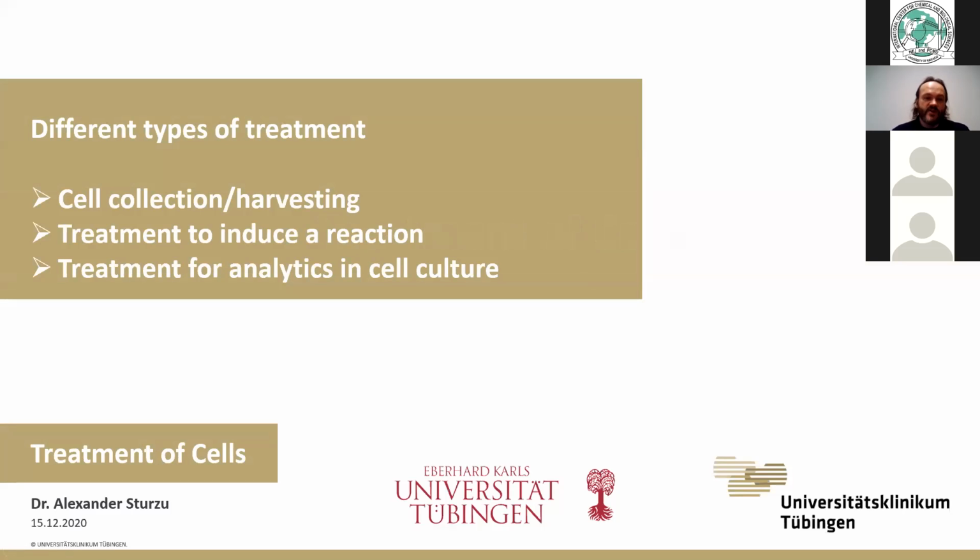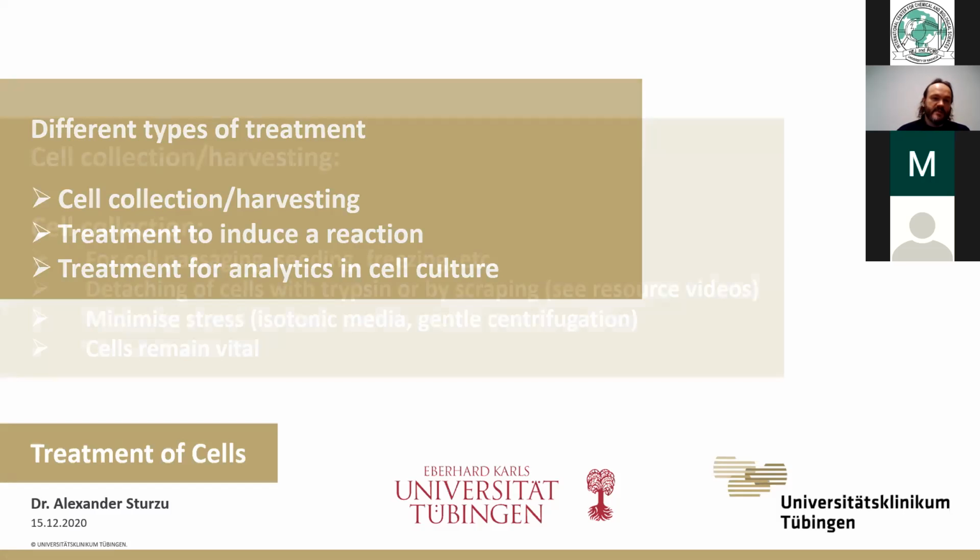The next is the treatment to induce a reaction, like if we expose our cells to some stimuli, which can be physical or chemical. But this is just the first step, and the analysis will come in the second step. And third is the treatment for the analysis, which is either in one step, directly the analysis, or in a secondary step after the reaction has been induced in the first step. And I'll take these one by one.